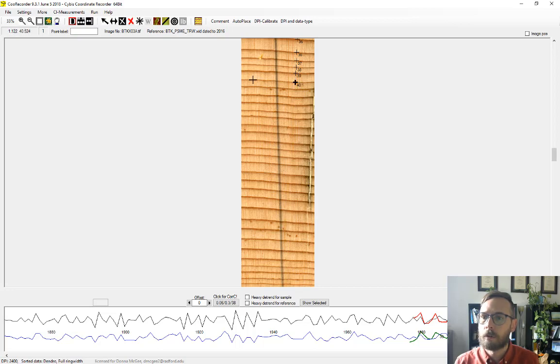Now let's say we wanted to do some manual work, but sometimes it's hard if you put in individual points to stay straight. You know, you're trying to as much as possible, but it can be difficult. You go off a little bit.